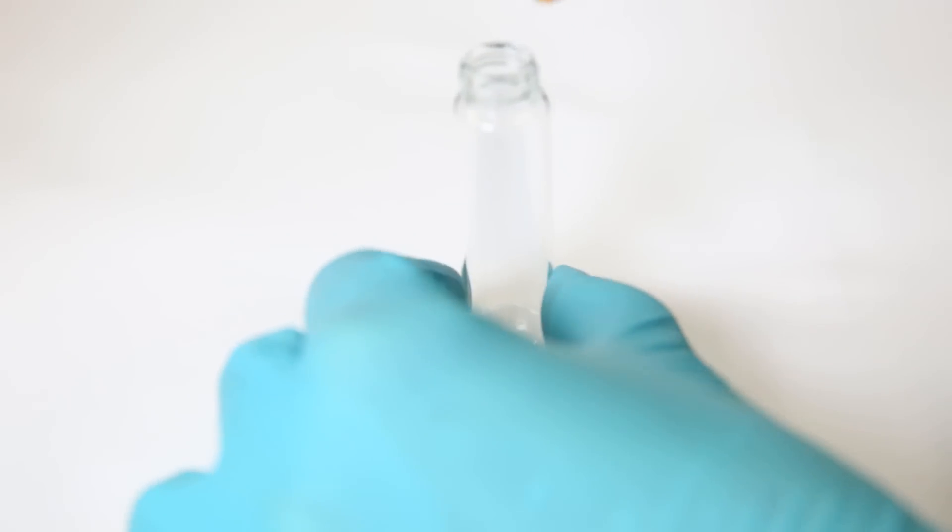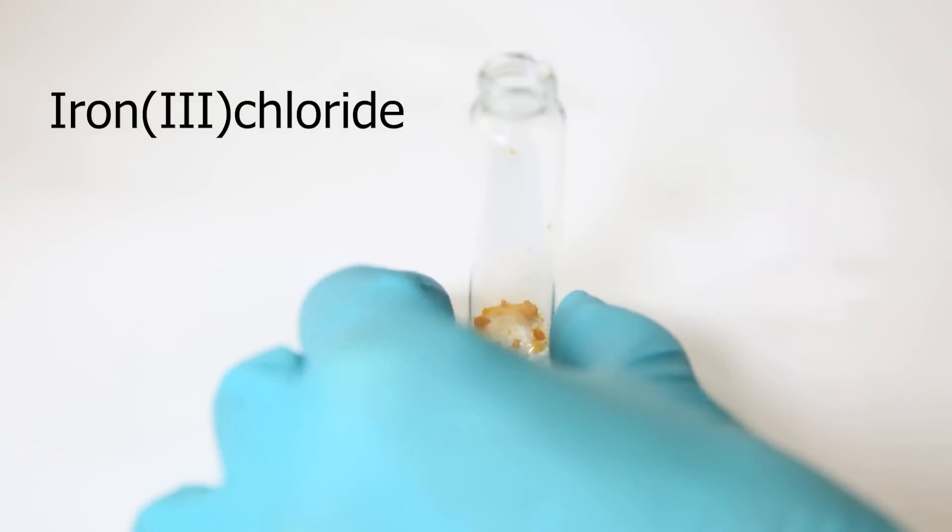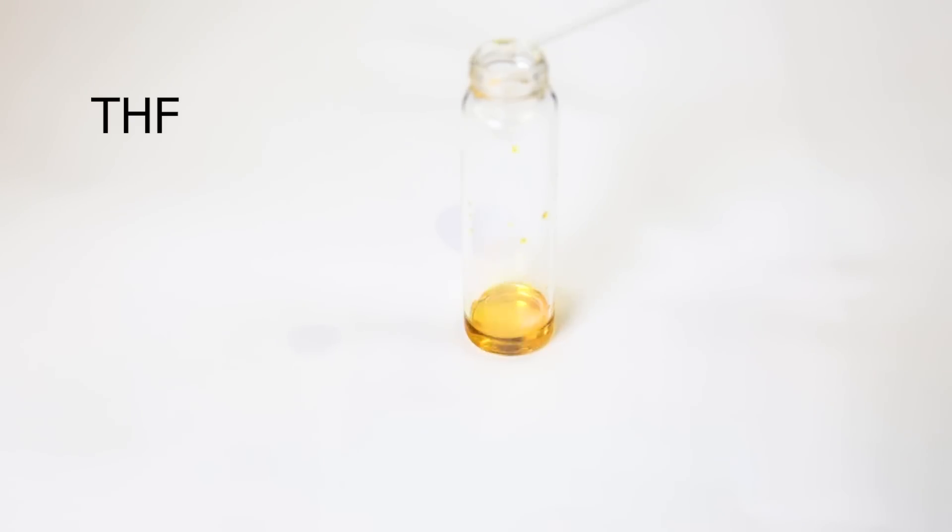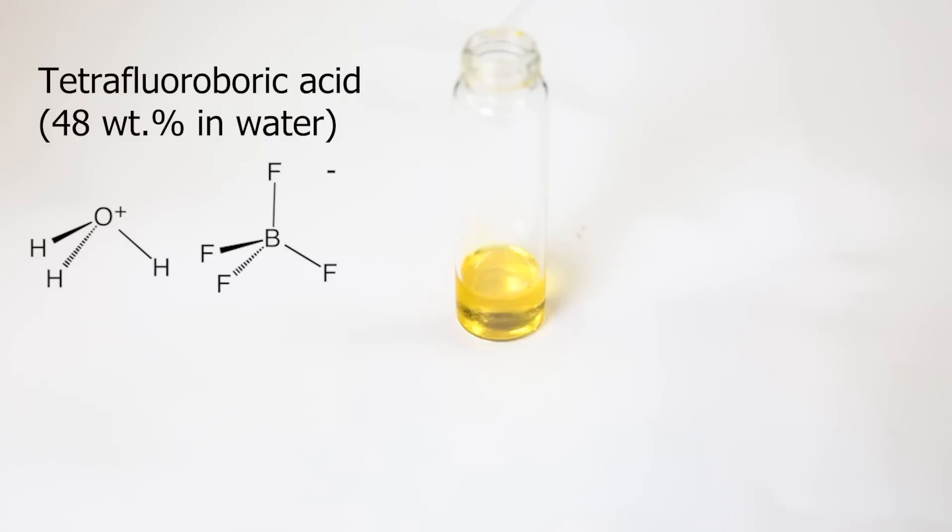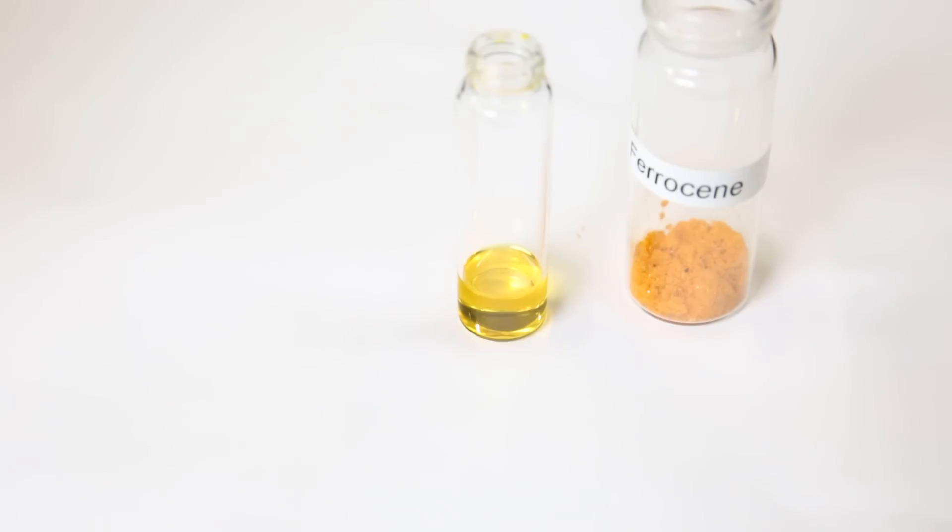So to a vial, I add a small amount of iron(III) chloride and dissolve it in some THF. Then to this solution, I add a bit of tetrafluoroboric acid. And as the final ingredient, the freshly made ferrocene.